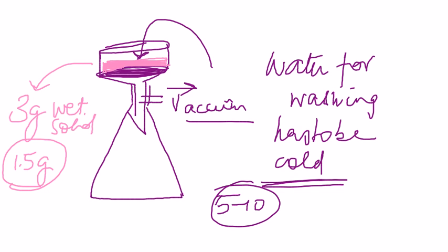After you have your material with you, the last step is to recrystallize it. By the way, all of this reaction, the heating process and everything, is going to happen in the hood. Again, acetic anhydride smells pretty much like acetic acid. And if you don't do that, basically all of us will smell like vinegar. So let's try to keep that contained in the hood. But you can bring it outside for the washing and all of that.